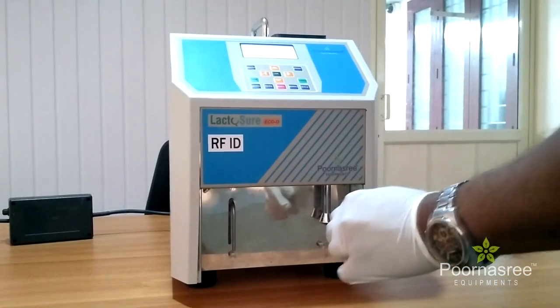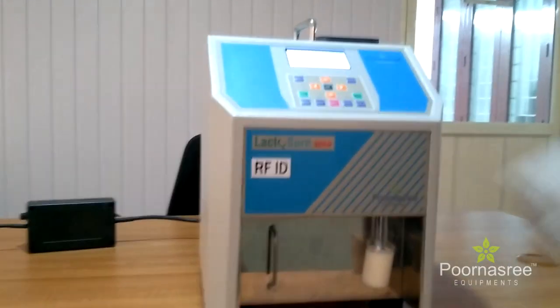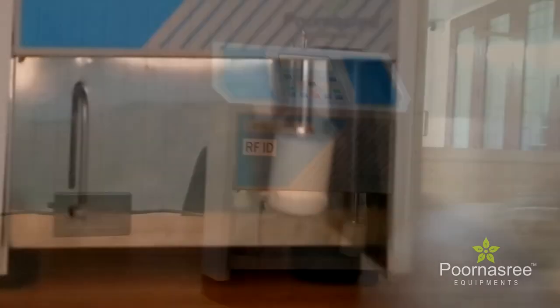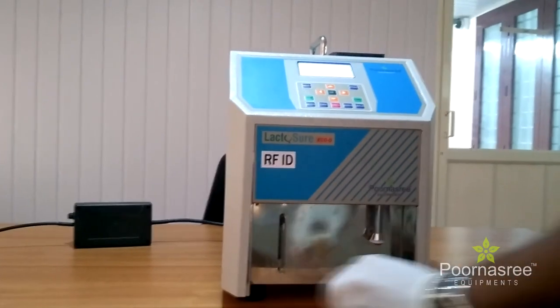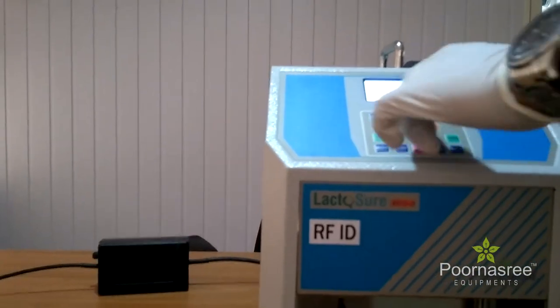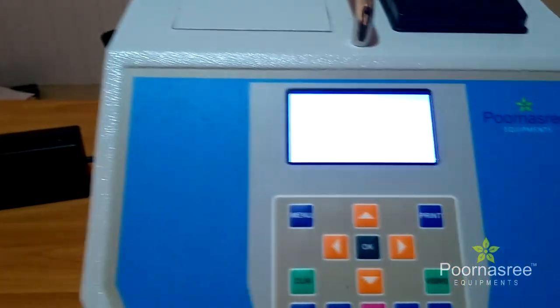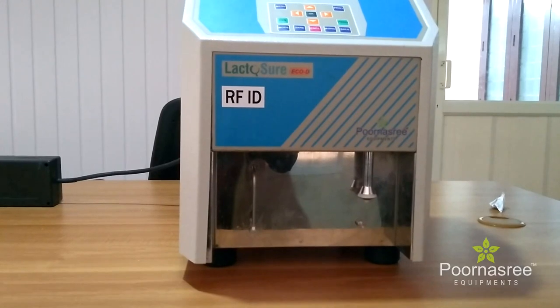We need to remove the air bubbles from the milk. For that, first we need to put the milk into the vibrator. Now switch on the vibrator. Now the process is completed. The milk is now taken to the analyzer for actual testing. We have now completed the removal of air bubbles from the milk with the vibrator.